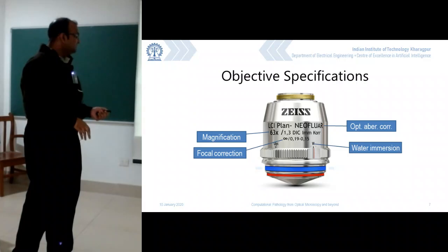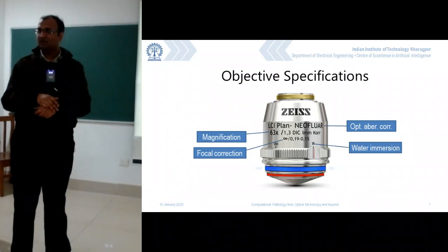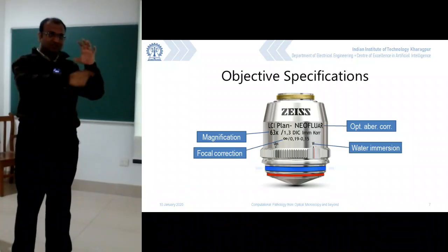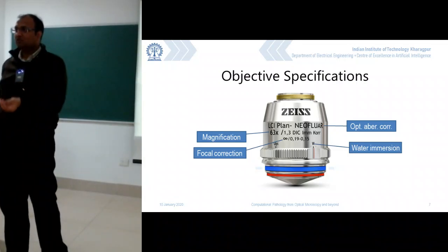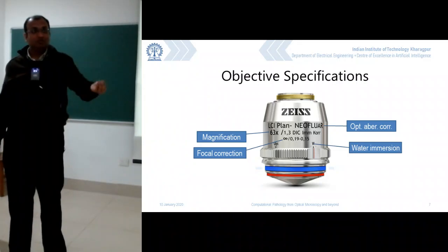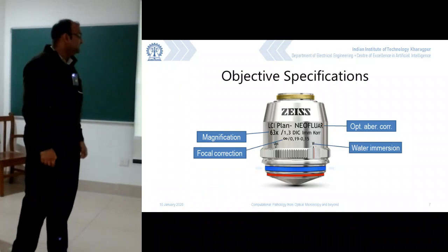So these lenses again have a jacketing to make them completely waterproof. So you have waterproof watches, waterproof cameras, waterproof lenses and everything, and around the lens, at the joining of the glass to that metal cylinder, there is a specific coating kept such that water cannot seep in through any of those pores. Water is a very small molecule, the smallest molecule ever available that can seep through anything. And now imagine you are trying to make a coating such that a single molecule of water cannot seep in over there. That itself is a very big engineering challenge.